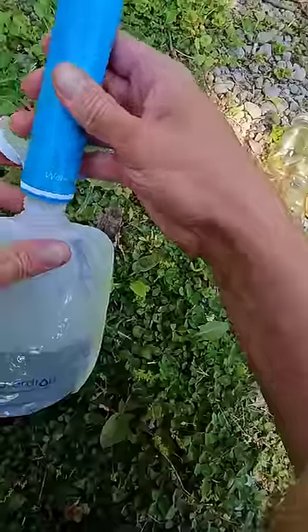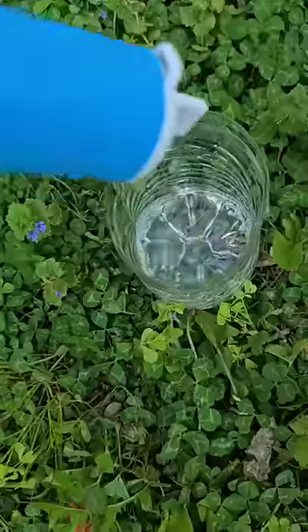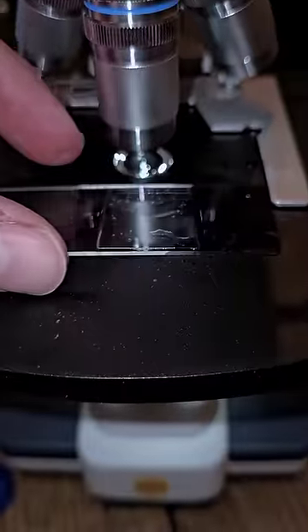All right, I've seen enough. Now I'm going to take the dirty pond water and put it through my filter straw. It looks completely different — it's coming out almost crystal clear, but that doesn't always mean it's safe to drink. So let's examine it.